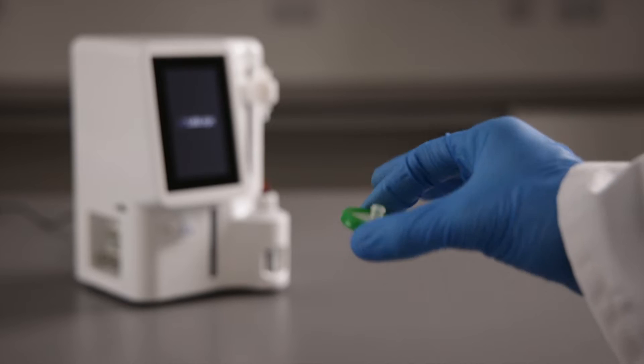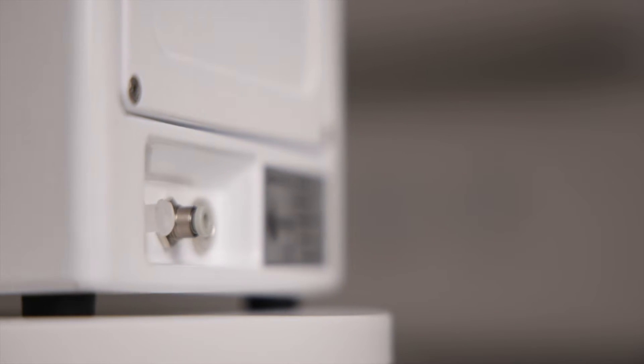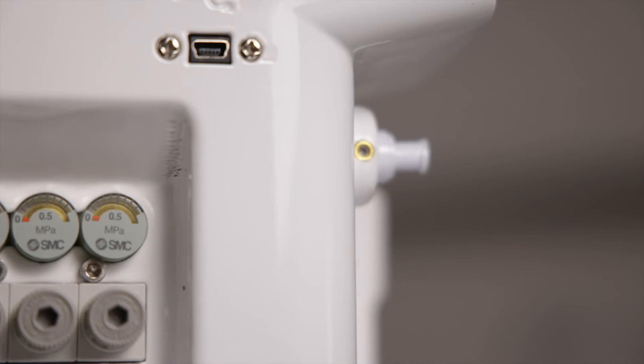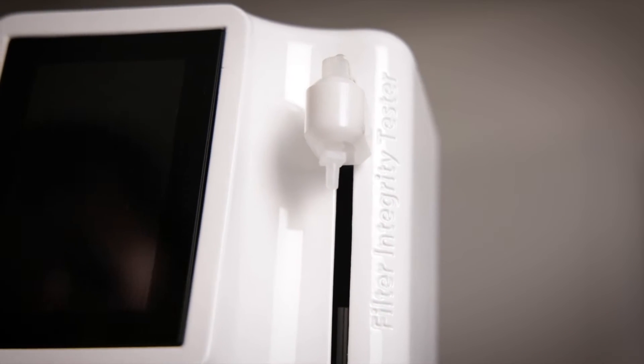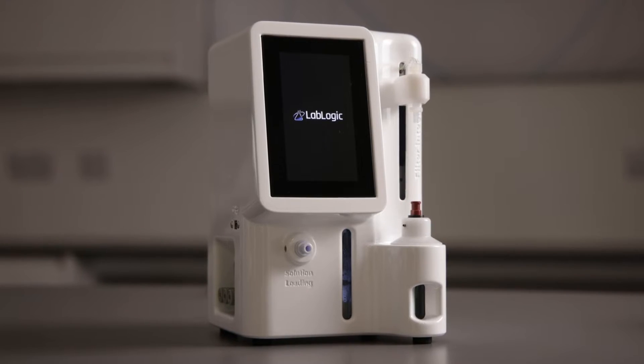Syringe filters are used exhaustively in production of radioisotopes to ensure that no microbiological contamination exists in the radiopharmaceutical. LabLogic is pleased to announce our new FIT filter integrity tester.